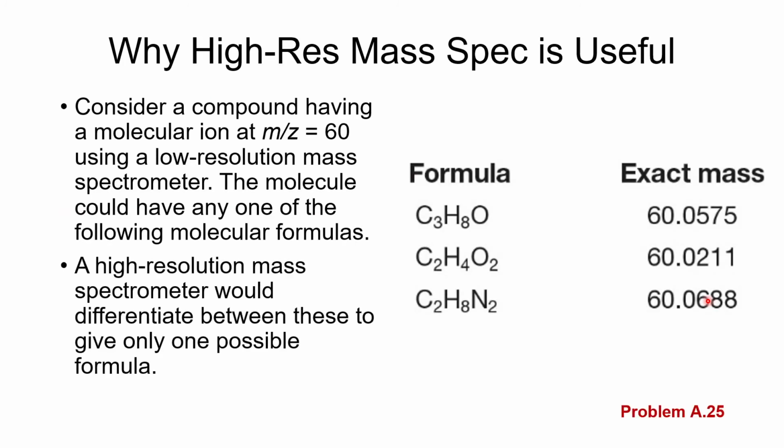All right, we already talked about that. So there's a thing that's called gas chromatography mass spectrometry. And gas chromatography, we've talked about in our lab.